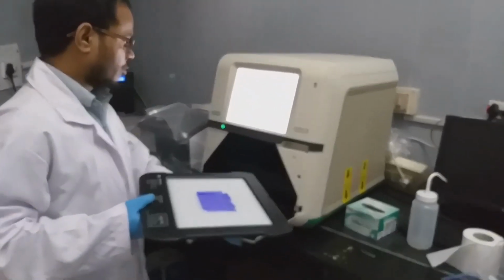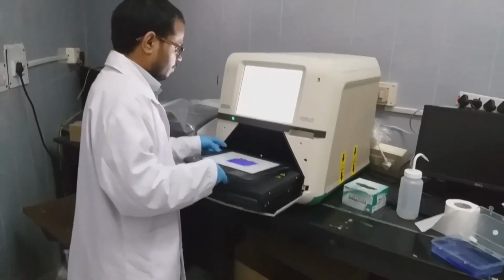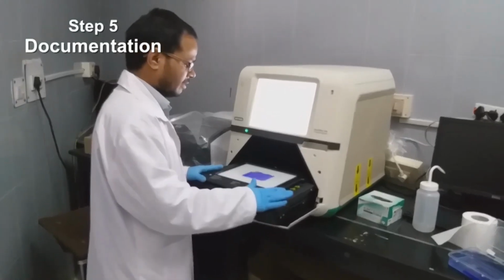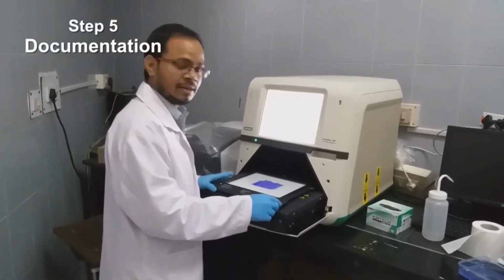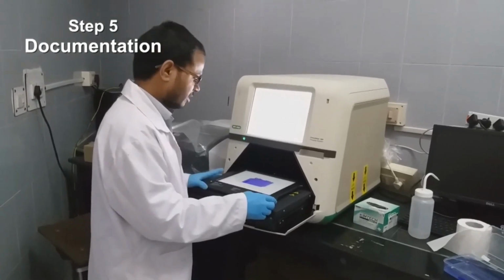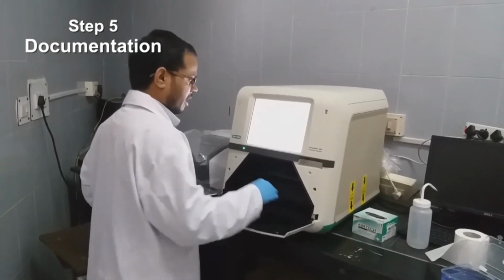So we have to open it properly. This is a very important step. You have to align the tray in a proper way, otherwise it will show an error. So once it is over, you just push it back.